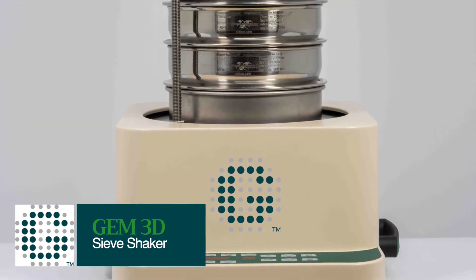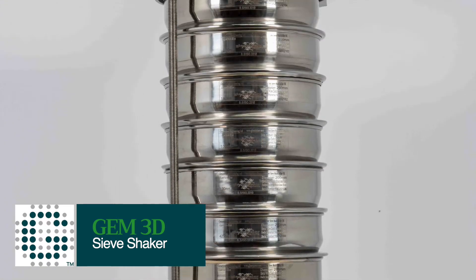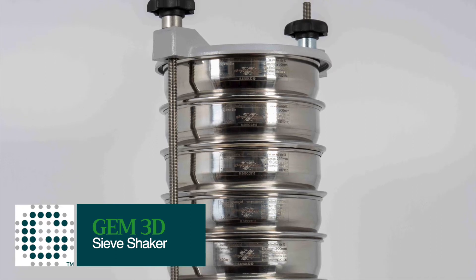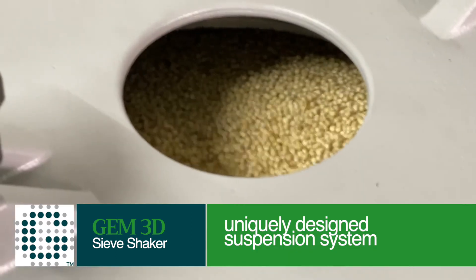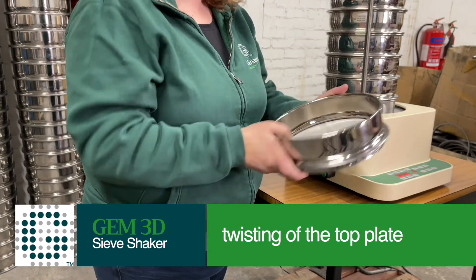Unlike Glenama's SQ analog, digital and variable sieve shakers, both the Gem basic and the Gem advanced sieve shaker models have a uniquely designed suspension system, allowing for 3D sieving action by the twisting of the top plate.